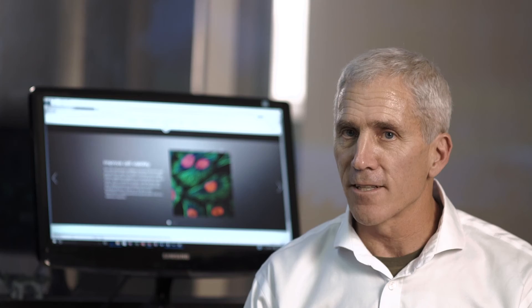There's a lot of cell sorting that happens at the level that the Wolf is able to accomplish. Now every lab can have their own cell sorter.